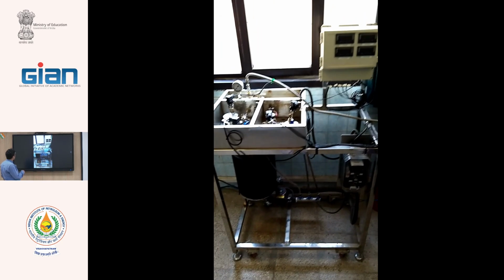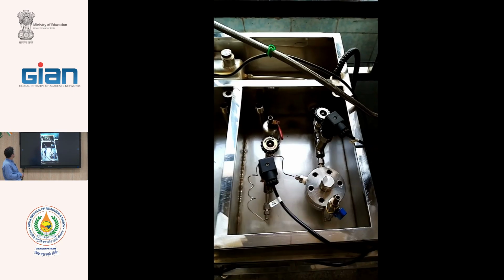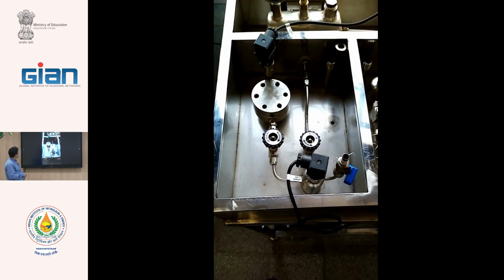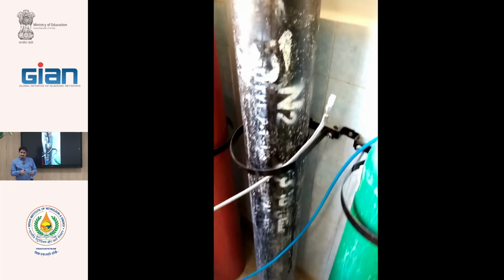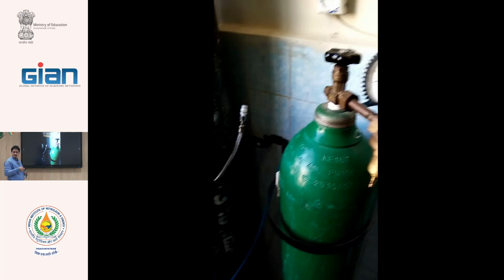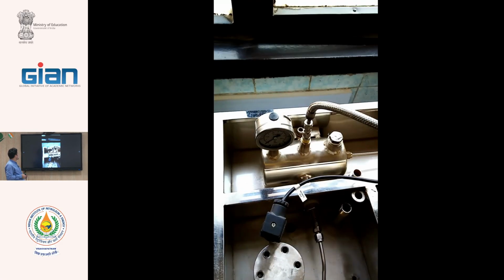This is better. This is the water tank. These valves are used for vacuum. Before testing, after placing the membrane, we vacuum the system to zero pressure on the permeate side.